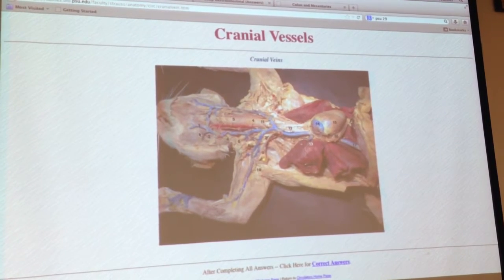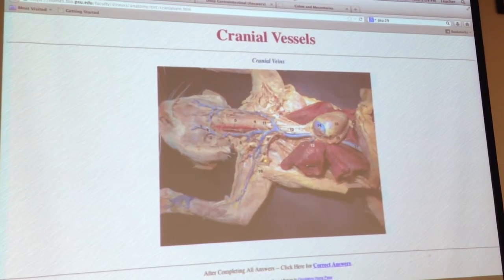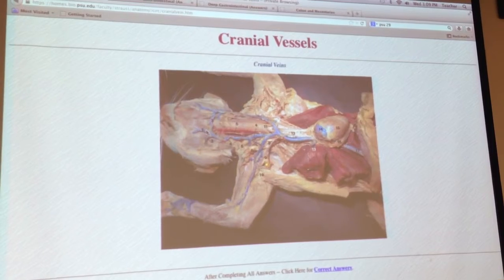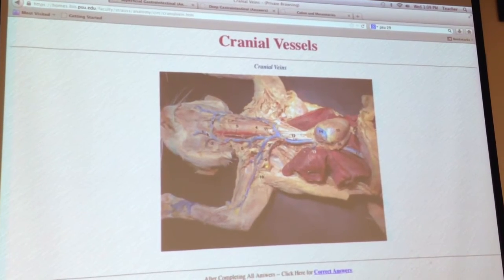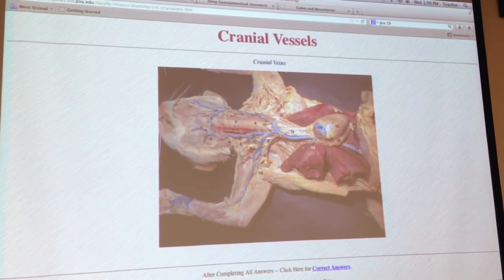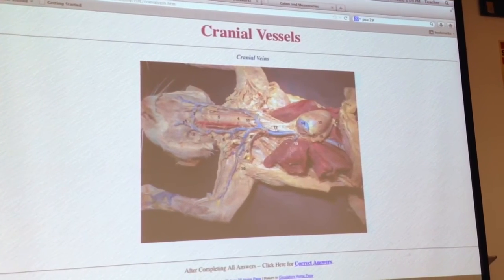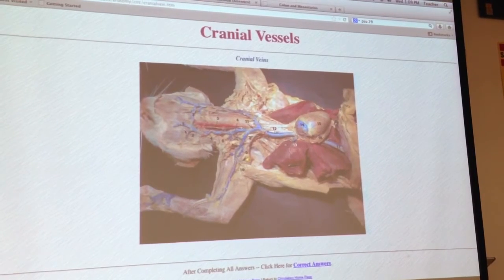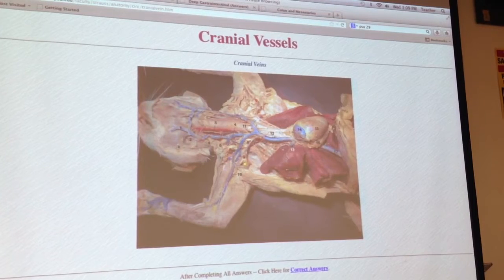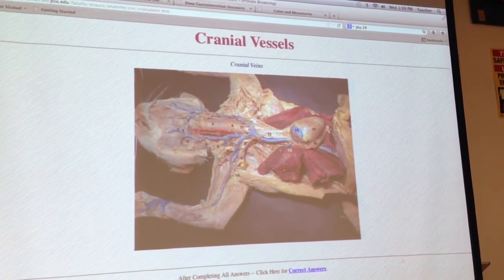Some of the glands are a little bit harder to decipher because we use them for muscles, and the glands sit on top of the muscles. So if you're not really sure about where these glands are on your cat or if they're still present, just call me over and I'll let you know whether you have them present, and if you do, I can point them out if you can't find them. So here's the mandibular or submaxillary, and here would be the parotid. So just remember, closer to the ear versus under the jaw.